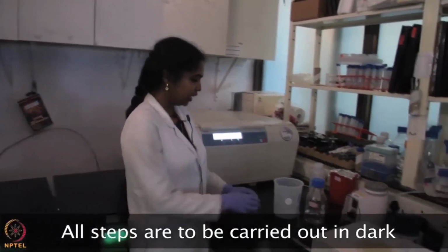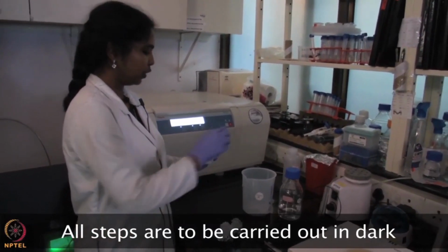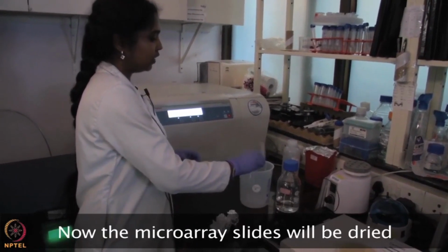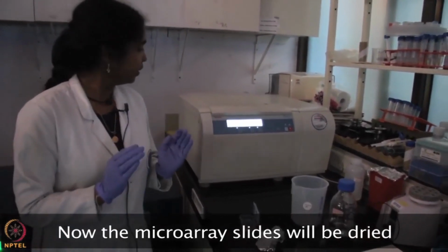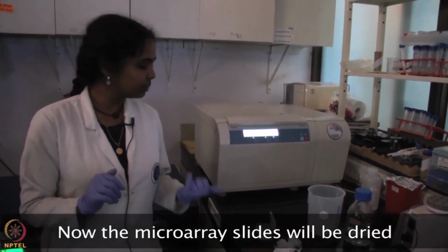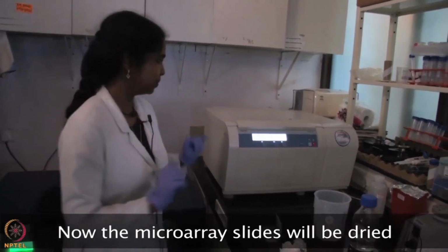After secondary antibody incubation, we again wash the slides the same way. Then after washing, we will dry the slides using a centrifuge, and make sure that all the steps have to be performed in the dark, because the slide is already incubated with Cy3 and Cy5 fluorescent labeled dyes.